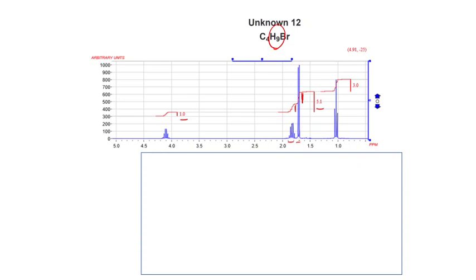And if you think about it, 5 is either 1 and 4 or 2 and 3, and we just eyeball this and say, well, that must be 2 and that must be 3. And besides, it's kind of unlikely that you'd have 1 and 4. You might, 2 CH2s, for example. But my working hypothesis right now is that that's a CH2 and a CH3.